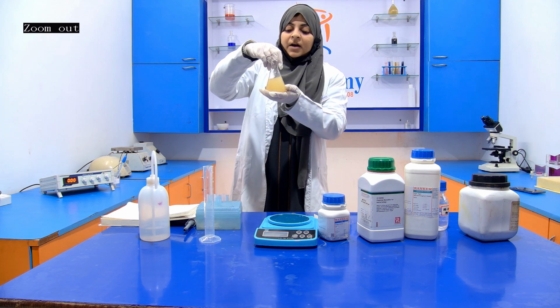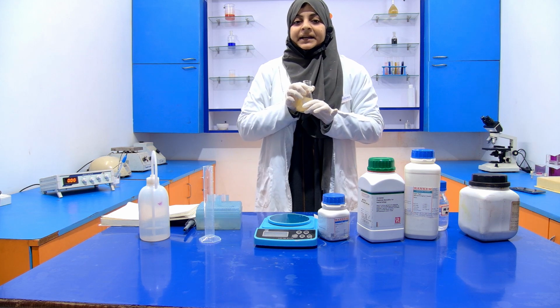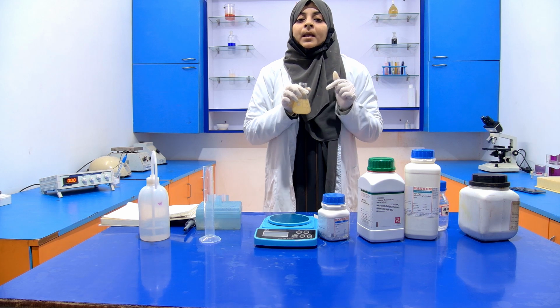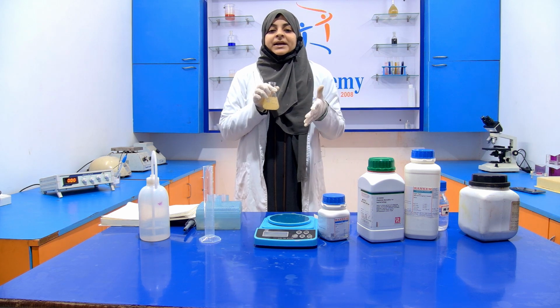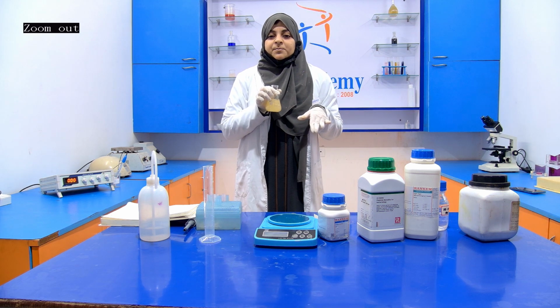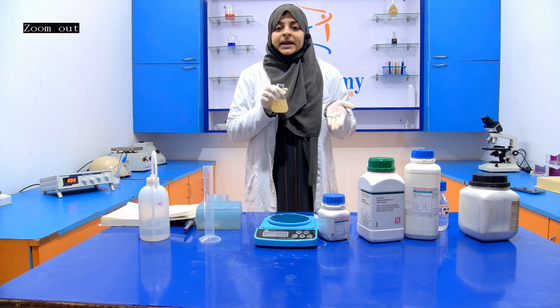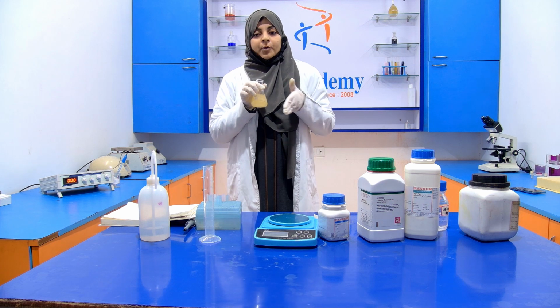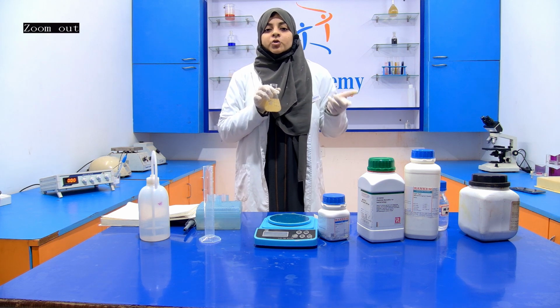Now after that, when all the ingredients are dissolved into the distilled water, we have to measure its pH. When we are measuring its pH, it comes around 6.8, but we have to adjust its pH to 7.4 plus minus 0.2.